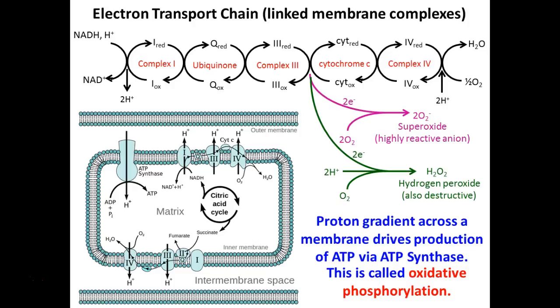And so next time we're going to use hydrogen peroxide to test to see if an organism has an enzyme to break down hydrogen peroxide, if it has catalase. As aerobes, we have to have this protection. We have to have catalase to break down hydrogen peroxide.